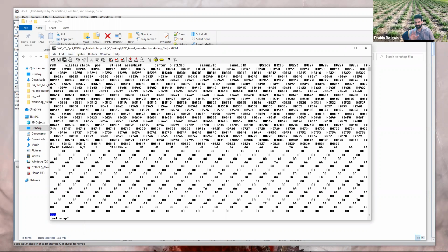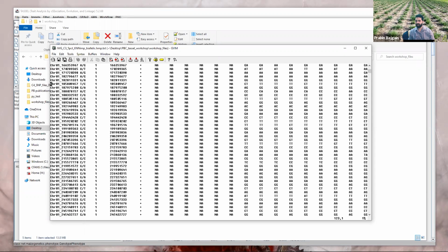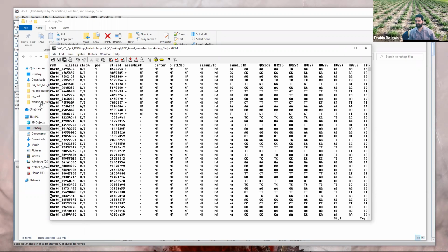and this is just a demo. You don't have to follow or anything. And if you'd like to use it, just let me know, email me later, and I can help you out. Then that sort of puts it in like a tab-based format, easier to look at for your eyes. You can do page up, page down, why not? And then you can select with a mouse on Windows. You cannot do that on Linux. Well, you can, it's different.